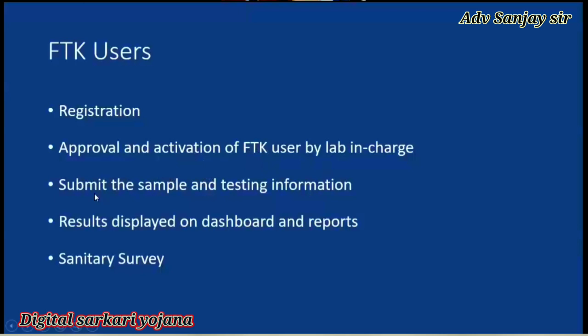Then the FTK user submits the samples and testing information. As soon as he submits the sample, the result is displayed on the dashboard and reports. One additional responsibility has been given to the FTK user, that is the sanitary survey. They have to do the sanitary survey and report it to the system. So these are the roles of FTK users. I hope some FTK users are also there in this VC. They will learn how to do testing entry using FTK kits and how to submit the samples. We will show it in the live demo.